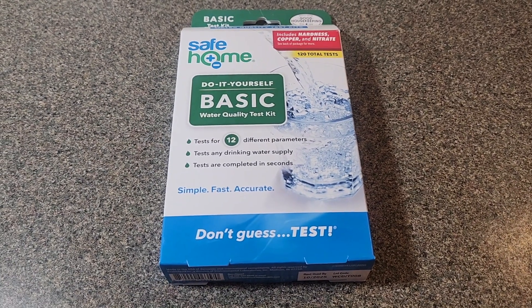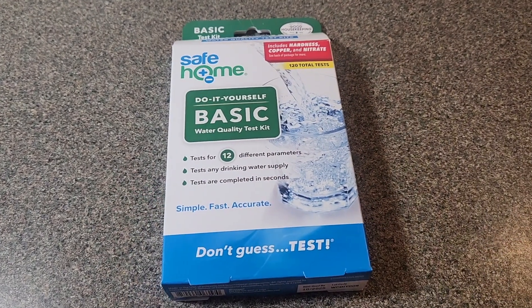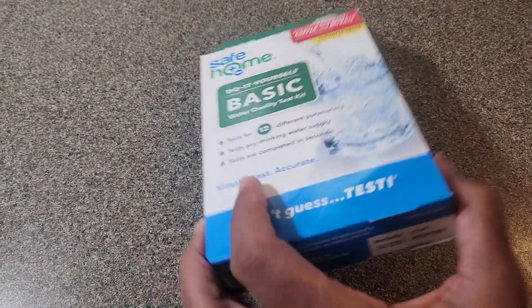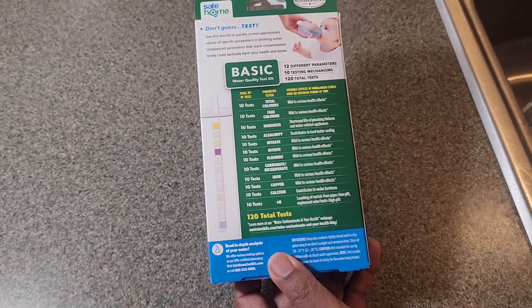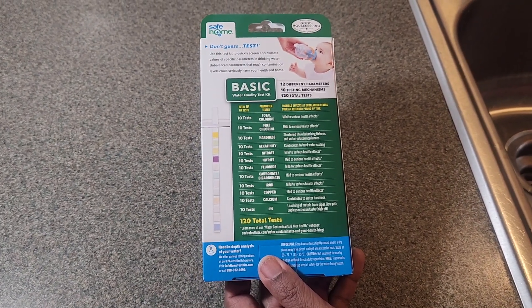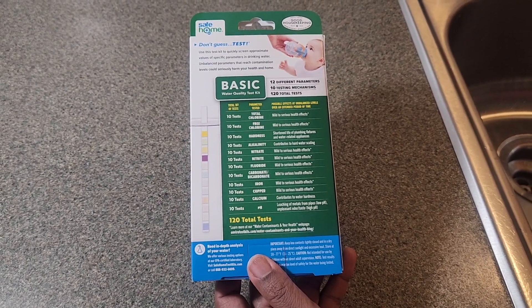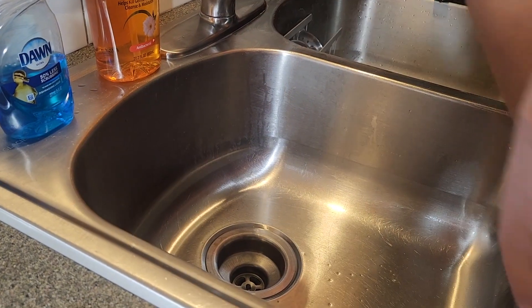Today we are going to do a DIY on the Safe Home do-it-yourself basic water quality test kit. I couldn't find any videos to actually show how to do this — there were a couple of different kits online but I didn't see one for this particular kit. So we're going to try this one today; we're testing our water in our home. Let's get started — make sure you wash your hands.